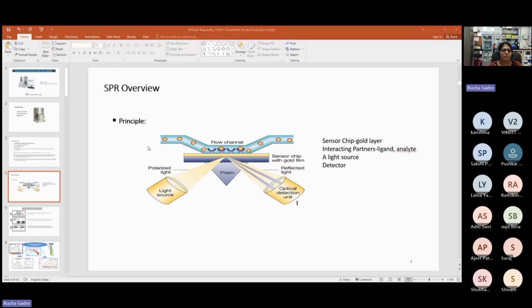Now, till now, what we know is how we get the SPR data. There is a ray of light incident on a metal film, and there is total internal reflection. This change in angle over time will give you the data. So what are the major events?